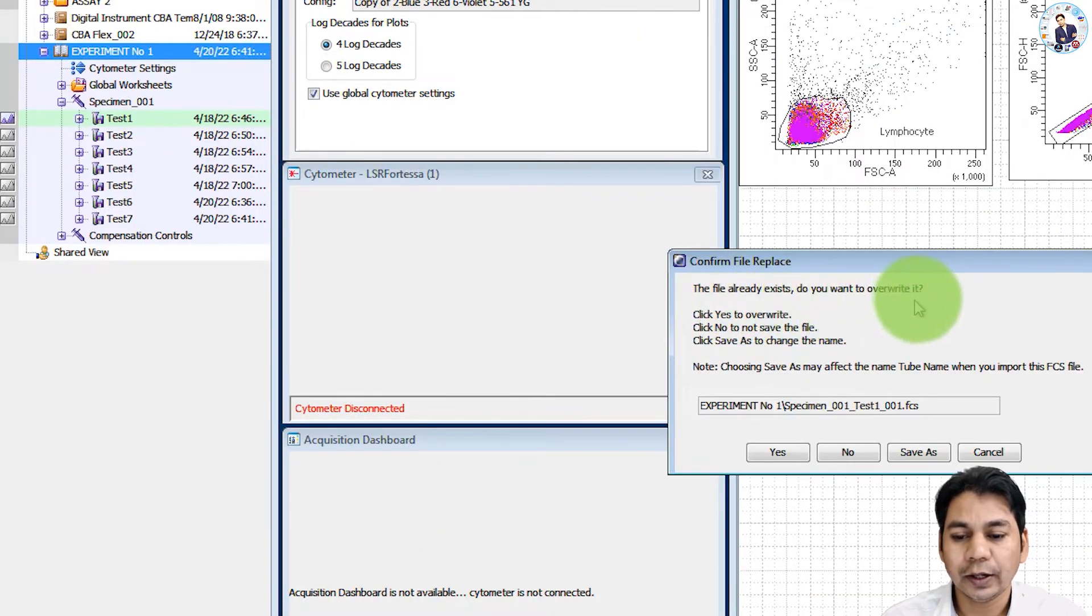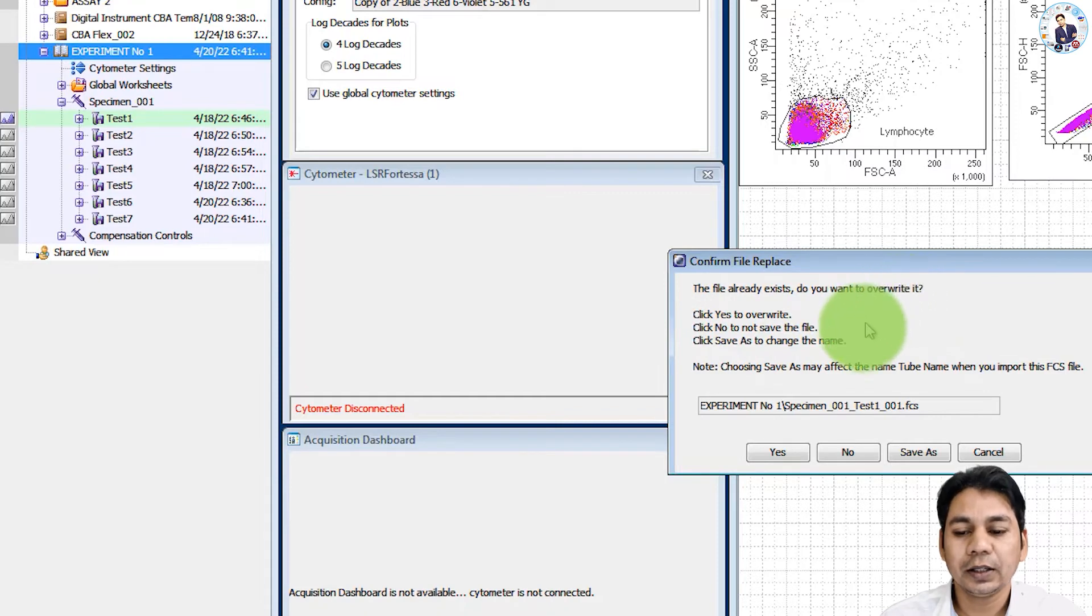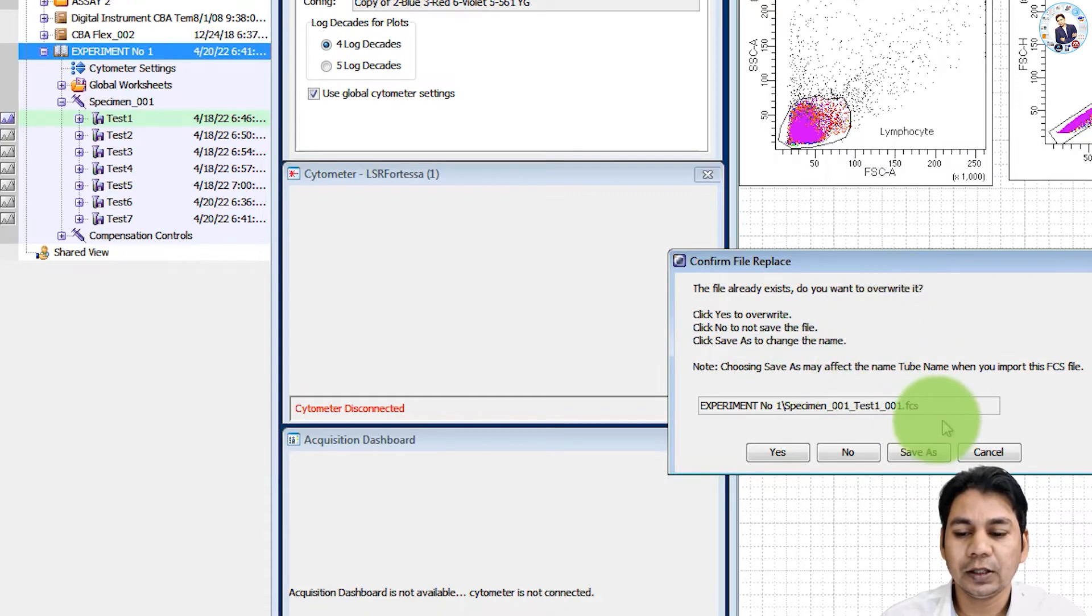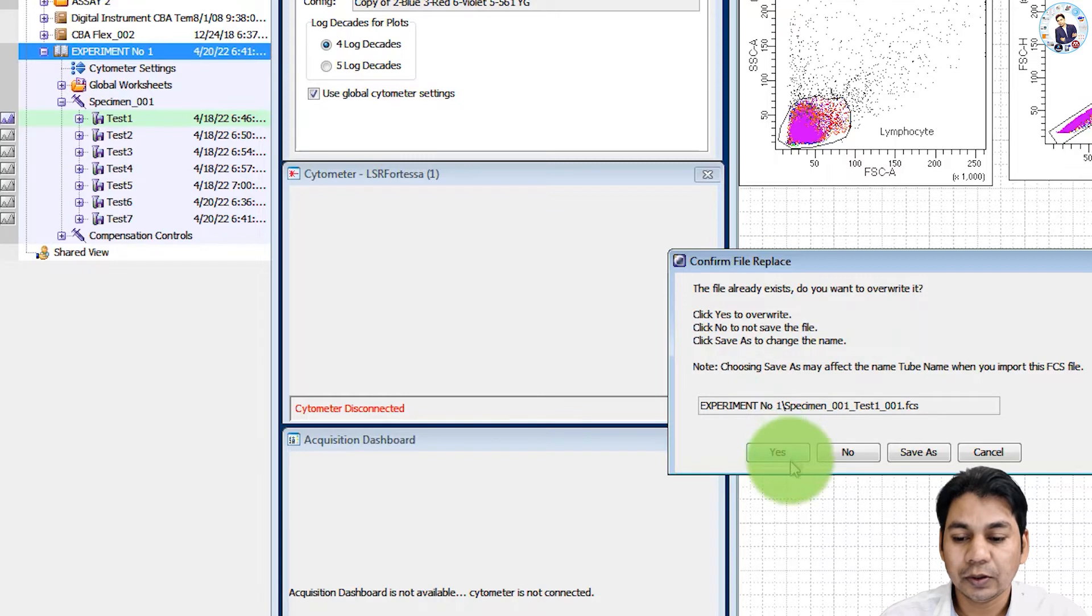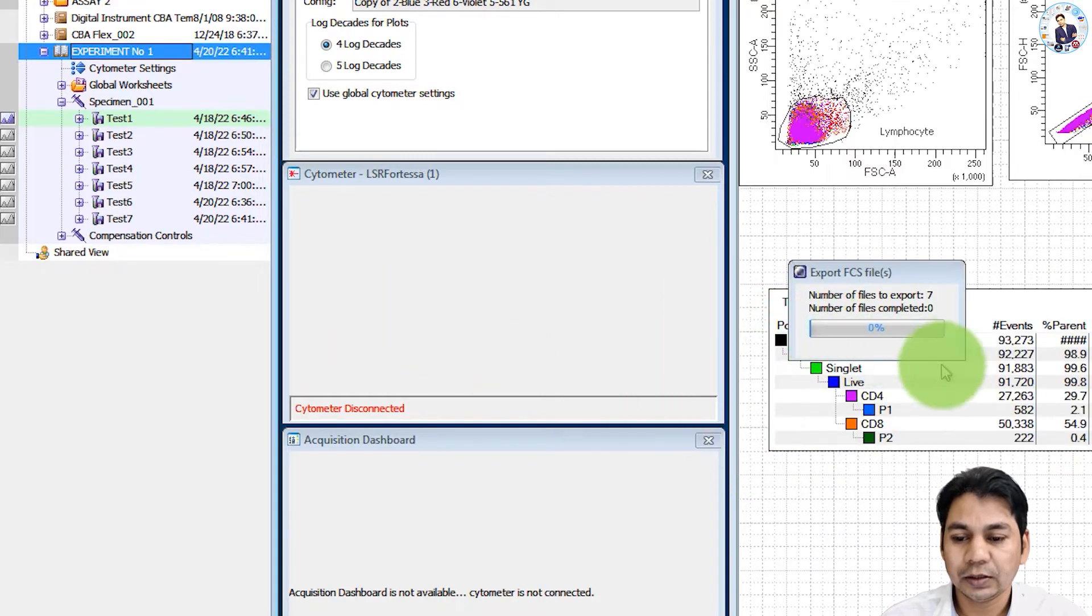The file already exists. Do you want to overwrite it? Because we have already exported four files, it is asking for replacement. So I am going to replace with this new file.